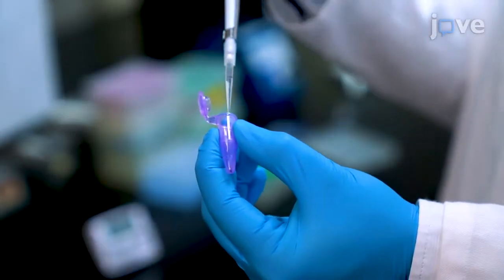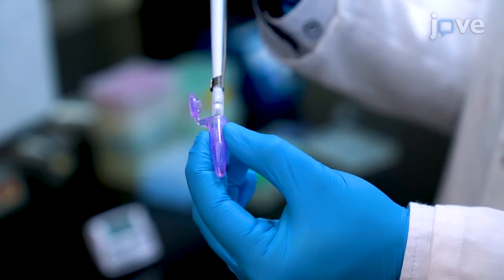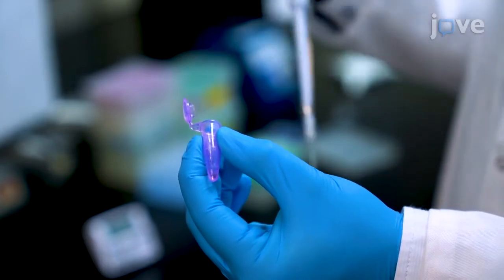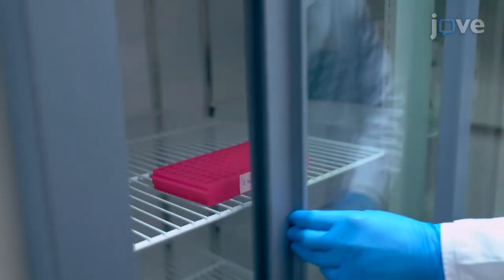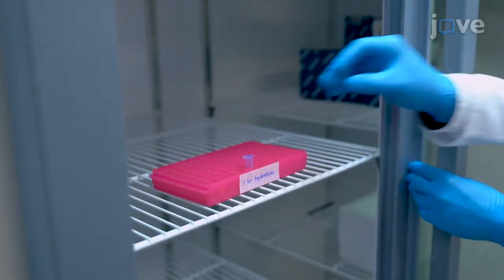To begin, hydrate the mosquito tissue sample stored in greater than 70% alcohol by adding 100 microliters of PCR-grade water and incubating for one hour at 4 degrees Celsius to soften the tissue.